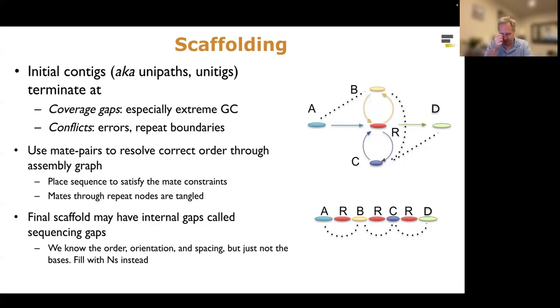In the case of the human reference genome to this day, if you're not using the T2T reference, you'll see that chromosome 1, for example, begins with N, N, N, N, N, N, N, N, where we know that there should be additional bases there. They just haven't been assembled. They weren't resolved in the references available. So be careful when you do scaffolding: you may see those N characters, which will be parts of the genome that have just not yet been fully resolved.